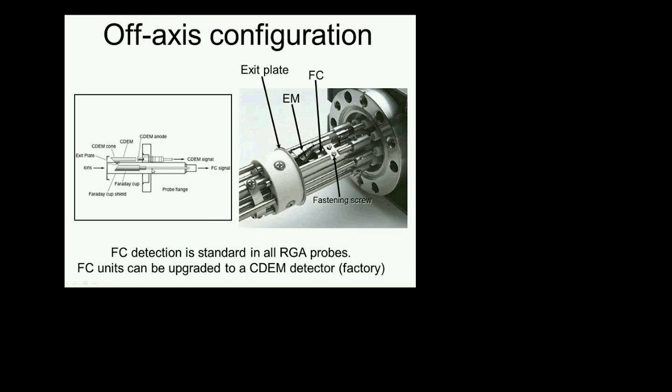An electron will come in to neutralize it and we will measure an ion current at the electrometer. On the other hand, if the electron multiplier is turned on, it will be biased to a negative voltage. As the ion comes in, it will find its way into the electron multiplier. It will not reach the Faraday cup, and now the amplified electron signal will come out here, and it will be measured by the electrometer through this connection.